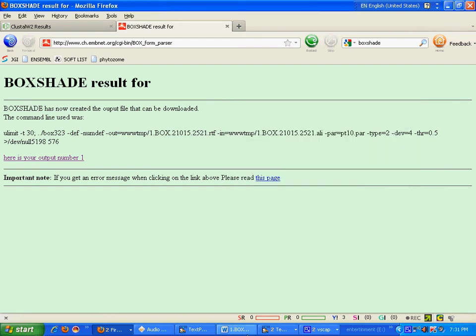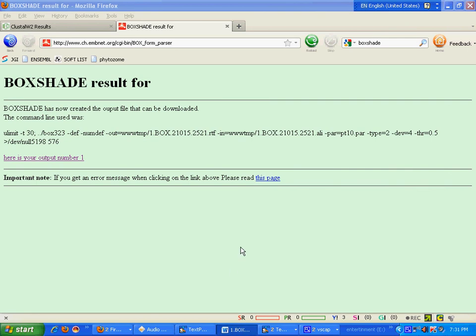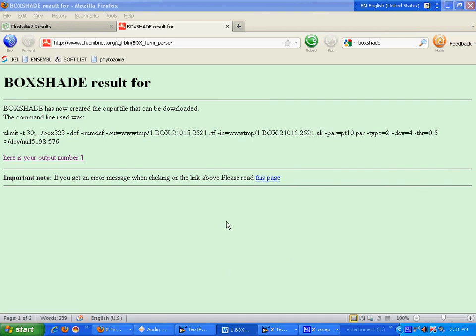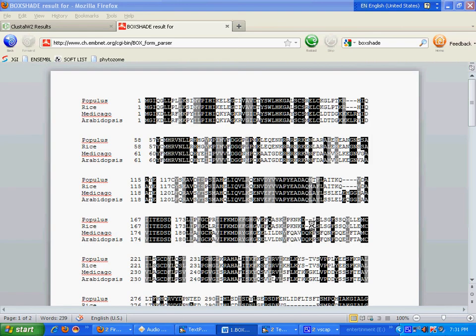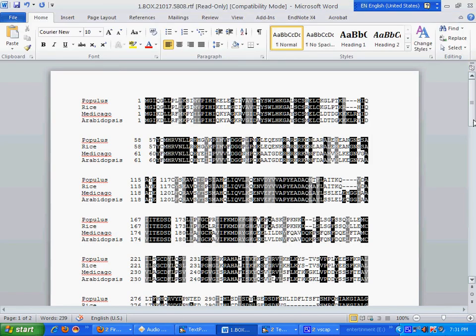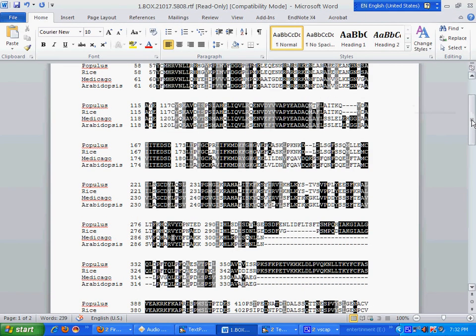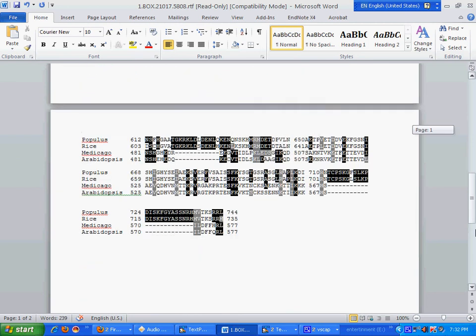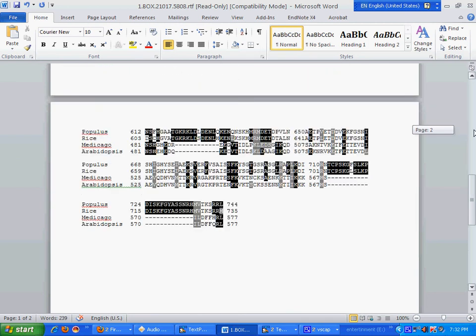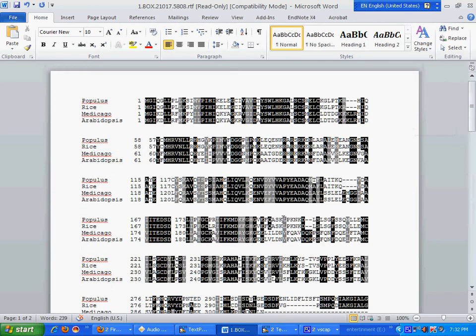Now, this is your final file. This is your multiple sequence alignment in pretty format. That's it for today.